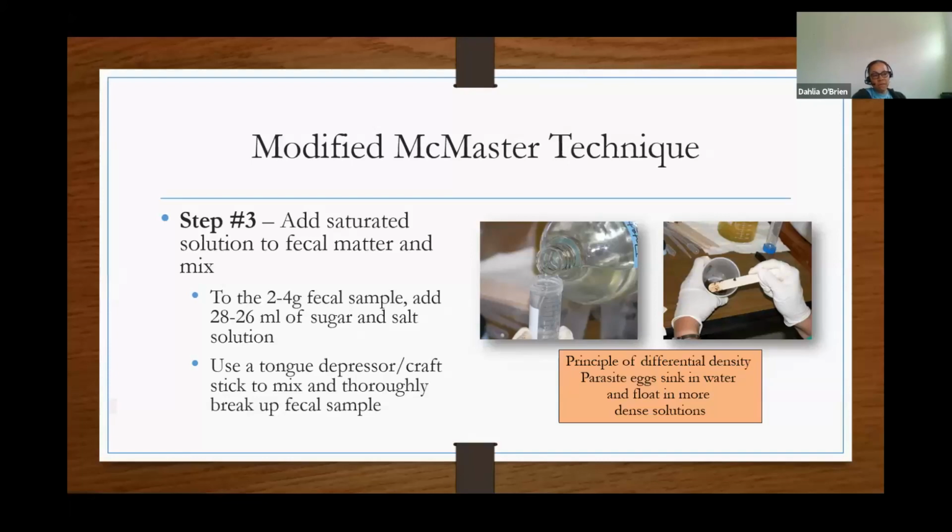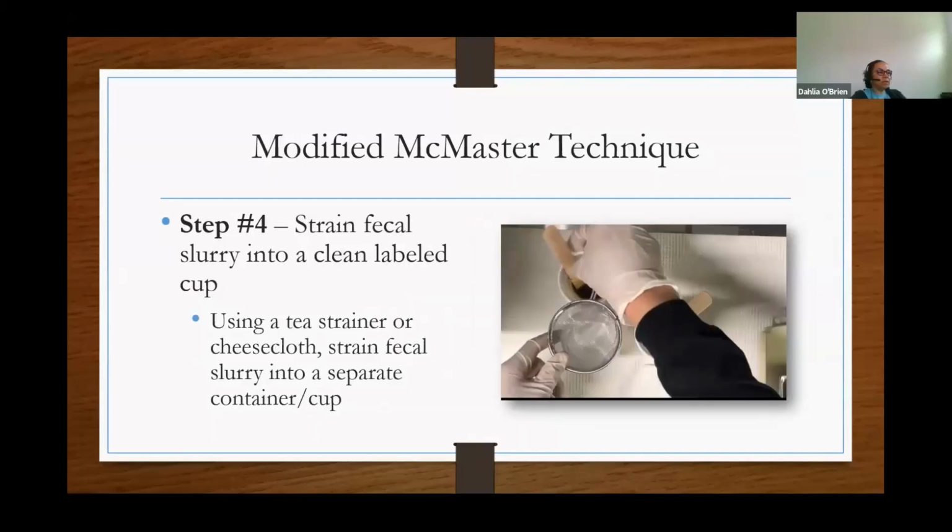You can also leave that fecal sample to sit in the flotation solution for a couple of minutes so that it soaks up some of that moisture and becomes softer and easier to break up. So again, it's based on the principle of differential density. The parasite eggs are going to sink in water. They float in these dense solutions.